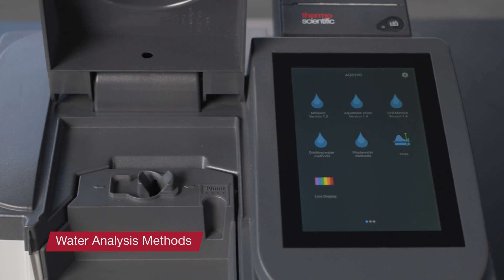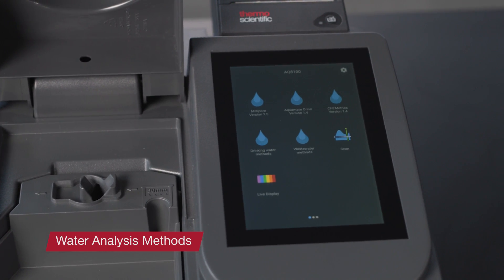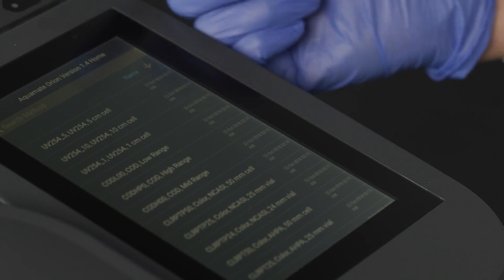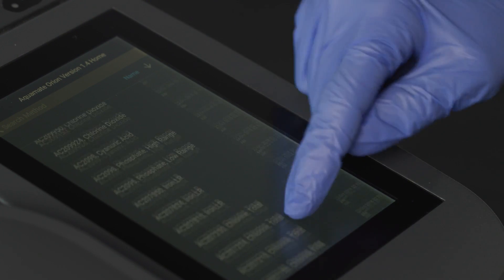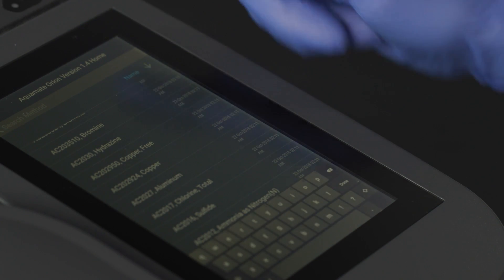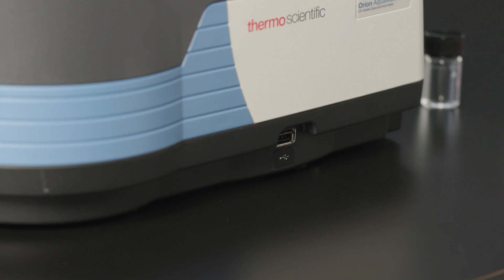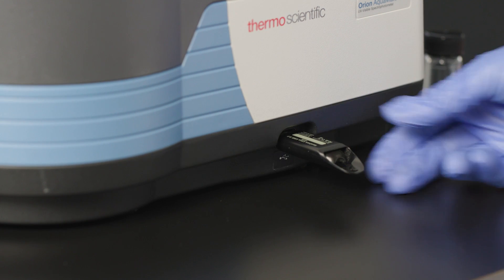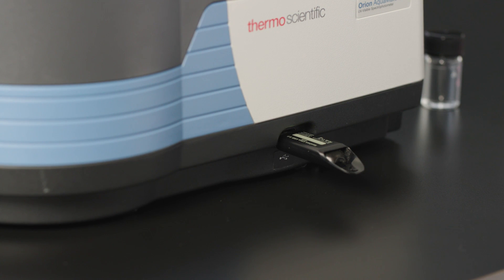Aquamate spectrophotometers come with over 260 pre-programmed water analysis methods. These include methods that work with our Thermo Scientific Aquafast reagents and some other manufacturer's reagents as well. And there's memory capacity to store many thousands of analysis results and custom methods or curves.